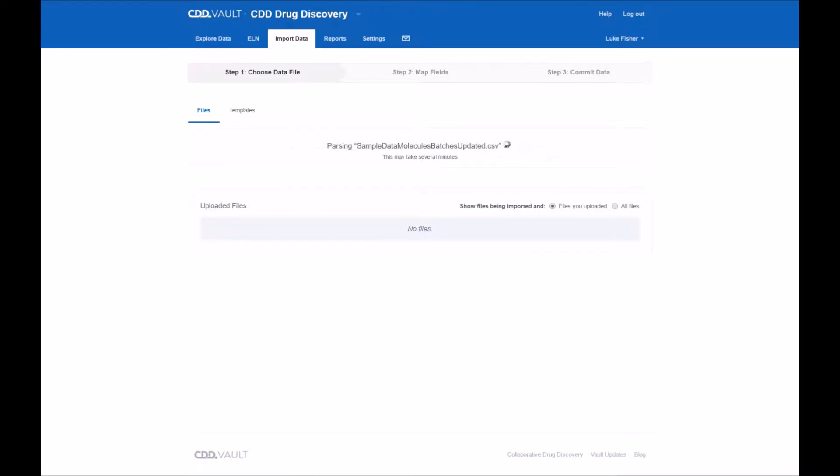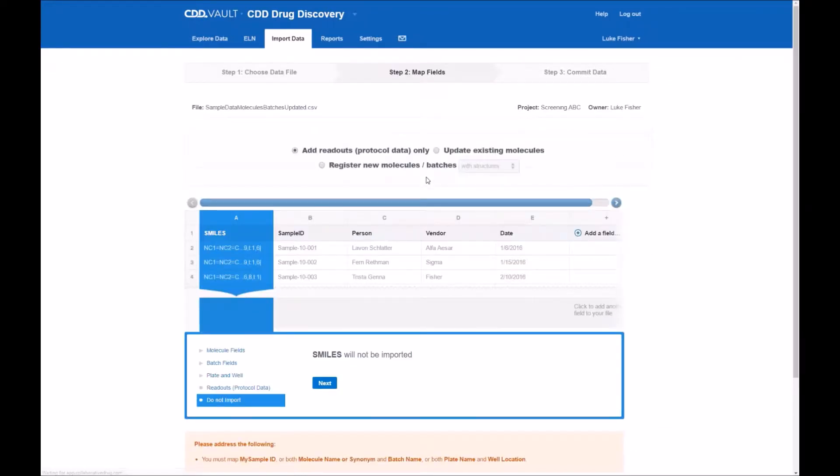Once you hit upload, you'll view this very simple but powerful wizard that has already interrogated the file and given you a series of steps you can take to ensure that the fields in your input file map to the fields within CDD Vault.